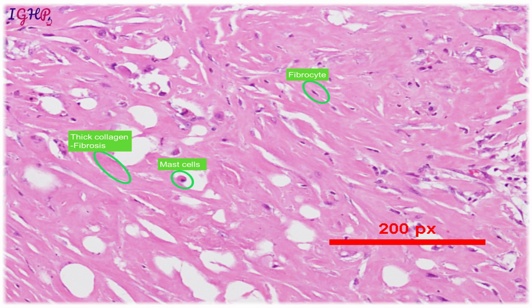So this is again an area of fibrosis where you see increased collagen fibers. You do see fibrocytes here, that is the fibroblasts and fibrocytes, and these fibrocytes are producing these collagen fibers. In addition, you are also seeing some cells, so these could be some mast cells and some plasma cells and lymphocytes here. So these are the floating cells, the unfixed cells in the connective tissue that we said, and these are the fixed cells, that is the fibrocytes, which are producing these collagen fibers.